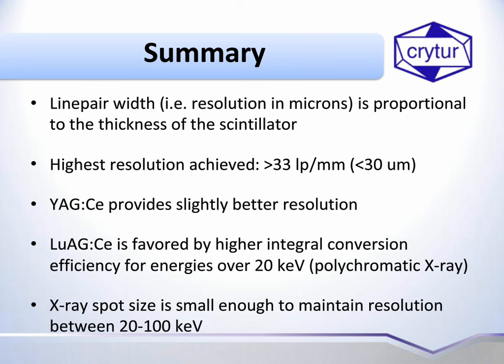What is the light collection efficiency of the taper? How does it compare to lens coupling? Well, it's a good question, and it's about numerical aperture. The efficiency of fiber optics is higher because the numerical aperture is also higher. For microscope objectives, you can have an aperture of about, let's say, 0.5, but for FOP, you get a numerical aperture of 1, or almost 1. You can collect basically everything you can get.